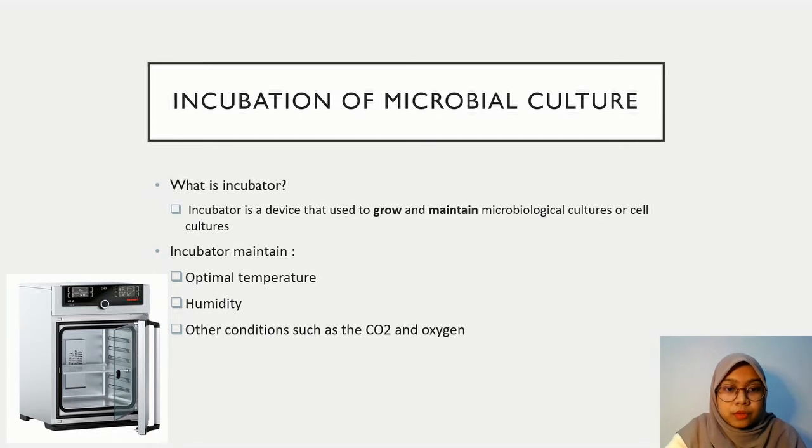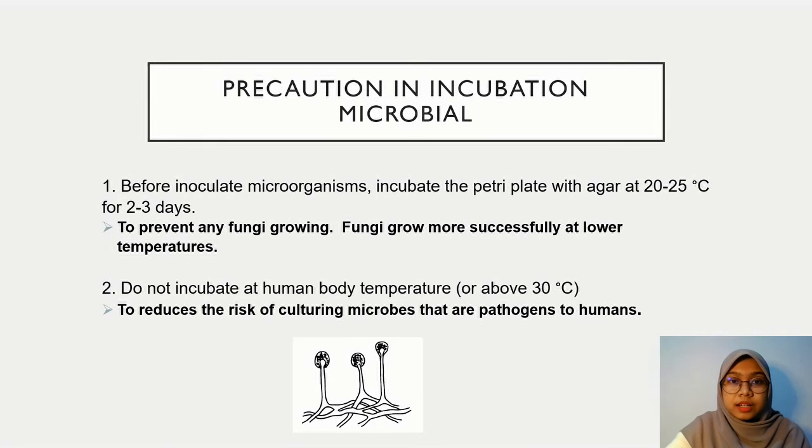The picture that I provide in the slide is the incubator that we normally see in the microbiology lab. It's not the same as the incubator used for babies or for eggs. There are a few precautions in incubating microbes.